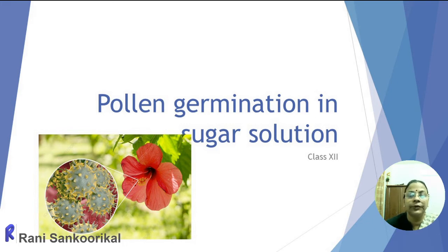We are going to demonstrate the practical sessions through video recordings. Because of this pandemic situation, we cannot call you to the school and do the practical sessions personally. So we are planning to send the YouTube videos of practical sessions. We have only two demonstration-type practicals, that is pollen germination in sugar solution and DNA extraction.